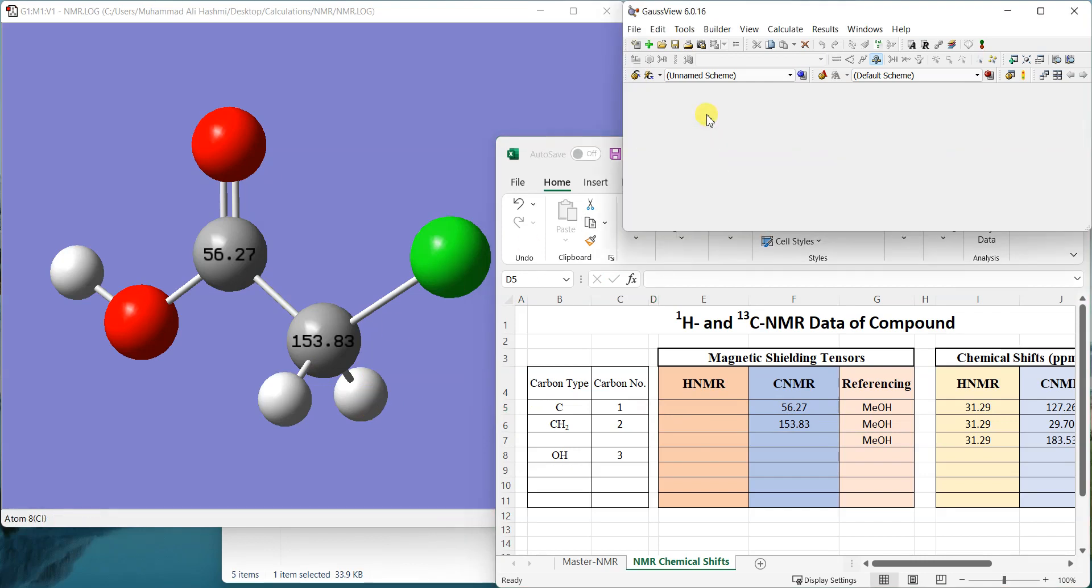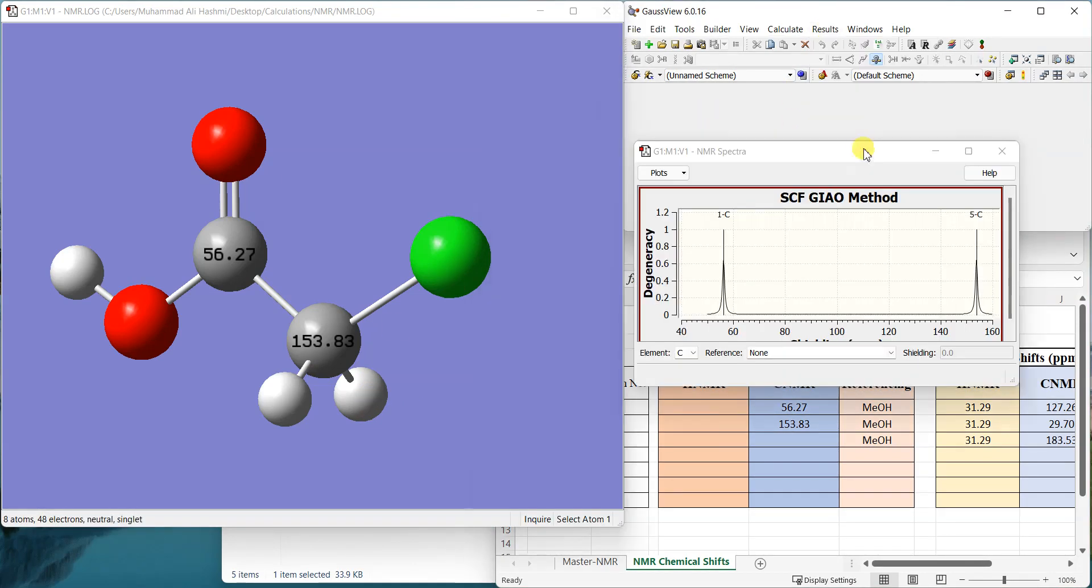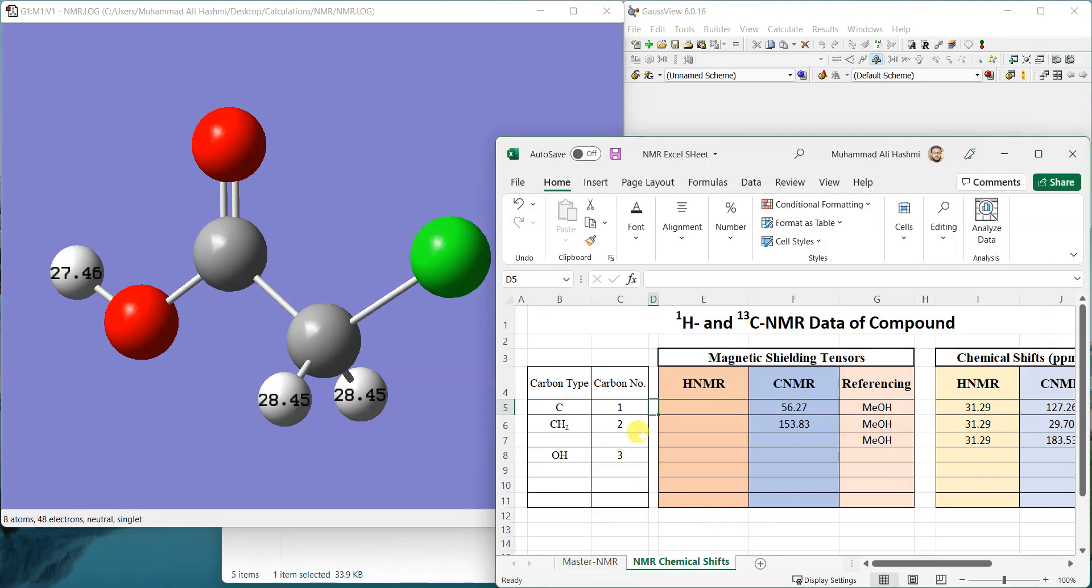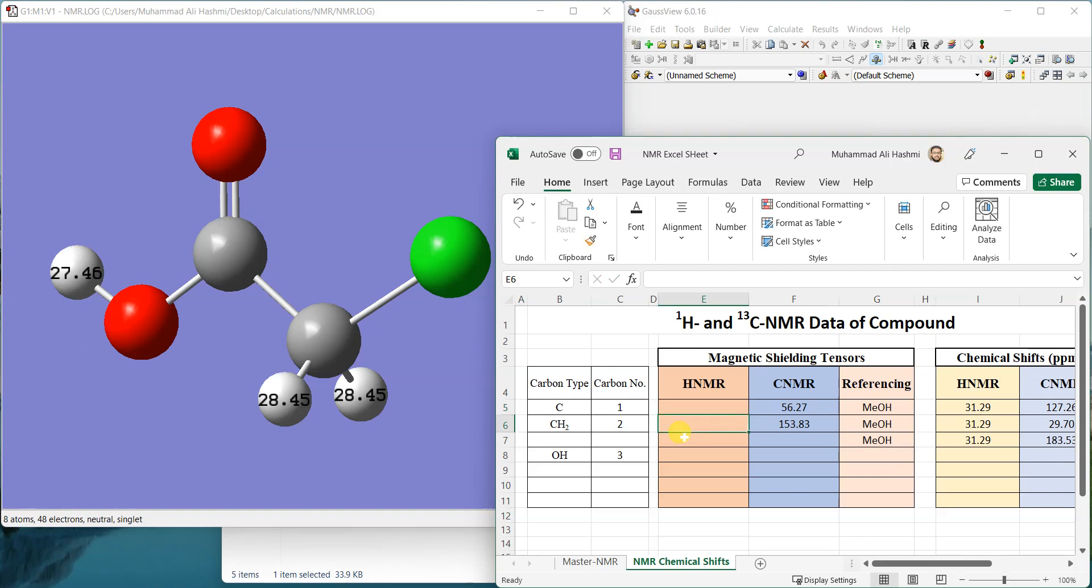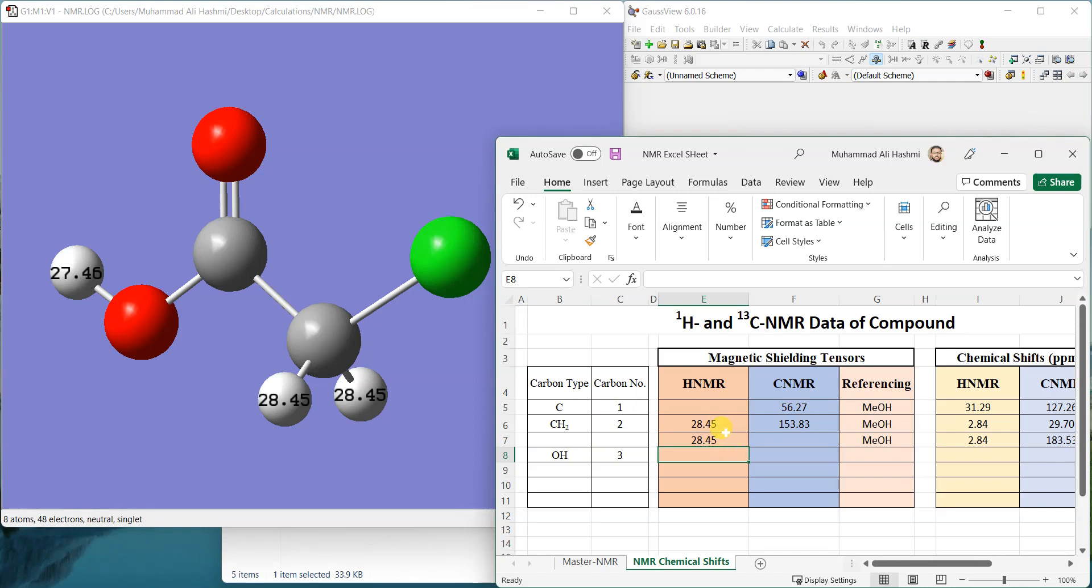Now I'll show the shielding tensors of proton and write it down. The first is a quaternary carbon, it doesn't have a proton. So for CH2 it's 28.45 and 28.45. In this case both of the protons are at similar chemical shifts. Sometimes you would have a CH2 where both the protons would be chemically non-equivalent, so in those cases you need to add them separately. But here we can just do it once because both of them are exactly same. Then I'll put OH as 27.46.